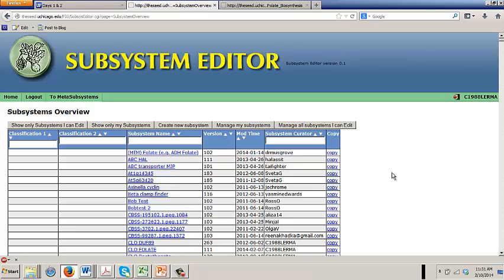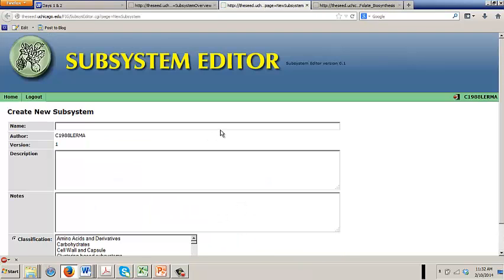We're all there. So you'll see a button at the top that says Create New Subsystem. Yeah, oh that's right. You still need to be logged in. If you're not logged in, this won't work. So you need to be logged in using your RAST username. Are you all logged in and on this page? Right, click the button that says Create New Subsystem.